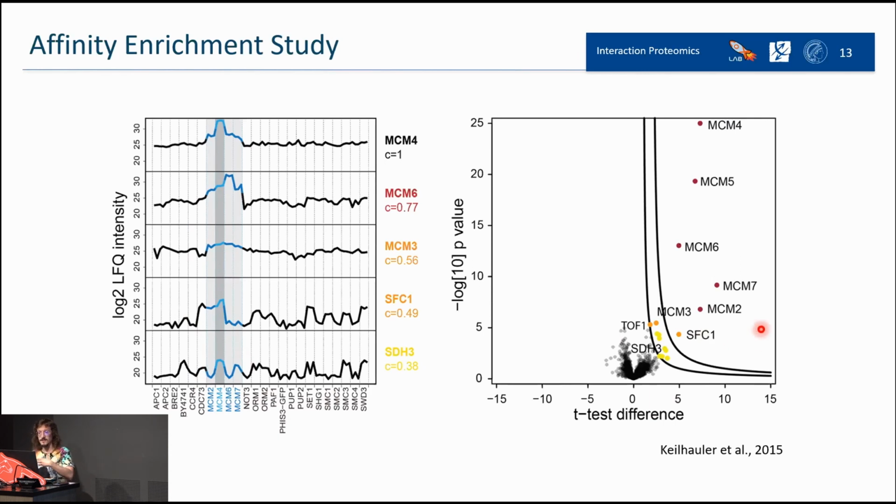And they checked also that the correlation in that single part of the profile plot was very high for these proteins, of course. But then also, if we get closer to the unspecific binders region, with a lower p-value, then the correlation here is, as expected, very low.